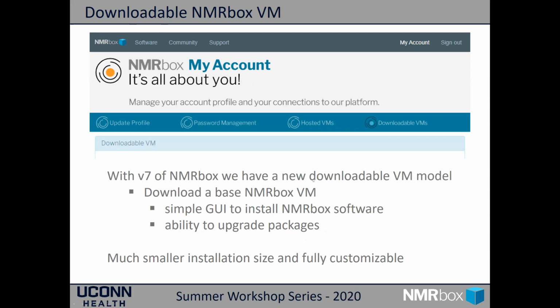I also talk about our new downloadable VM. I've already shown this to you on our website. Once you authenticate and go to my account, you can go to the downloadable VMs and you can download a local copy of the NMRbox VM to your local computer.